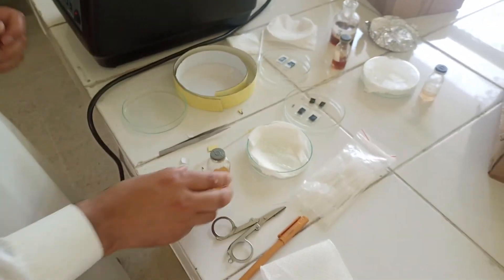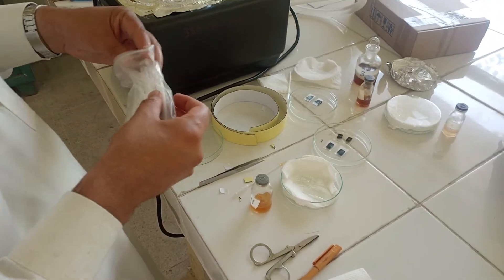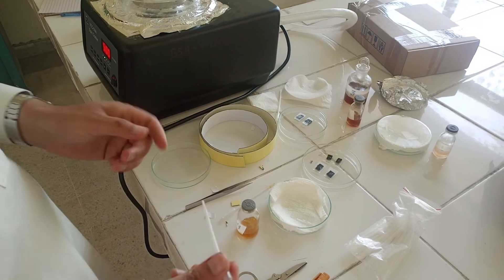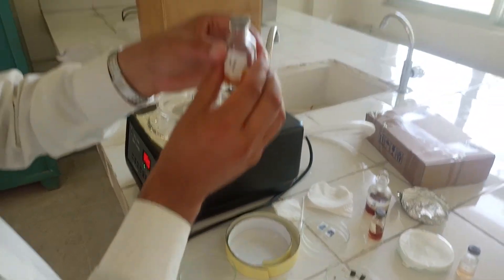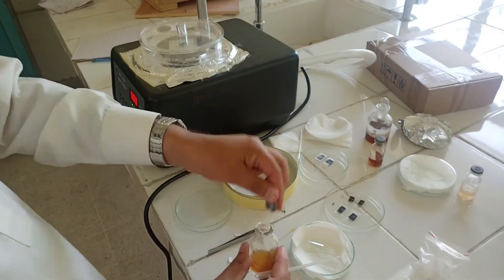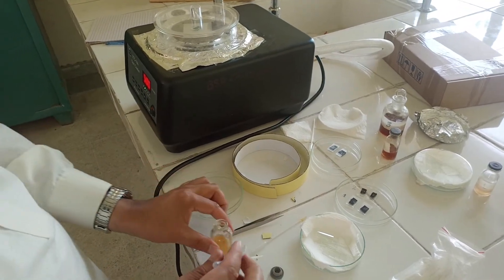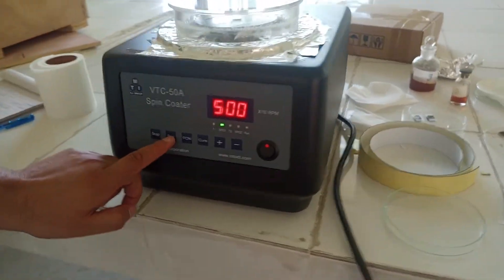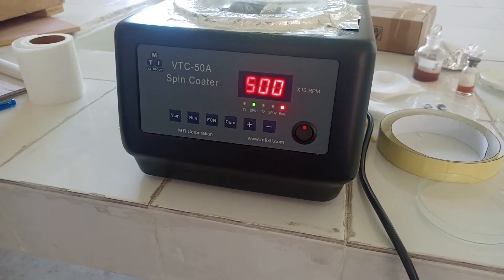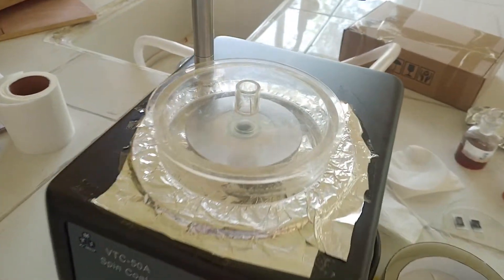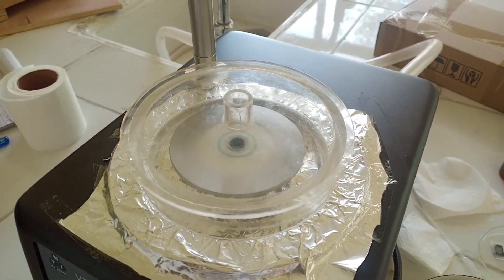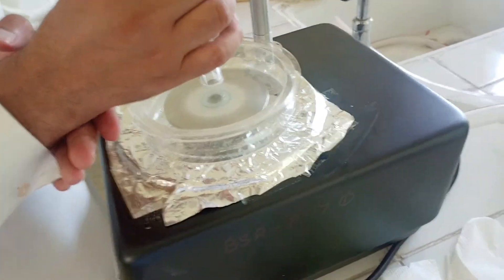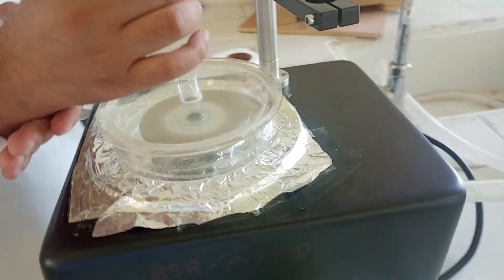Now when we start, we will take a dropper. It is our disposable dropper and here we have a solution. So before taking our solution and dropper, we will start this. Here, run. Now we are going to add drop-wise. Here we will put our drops.